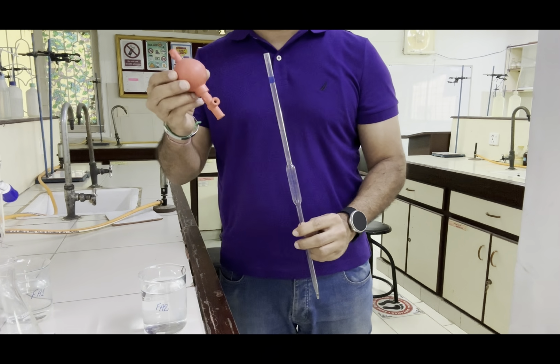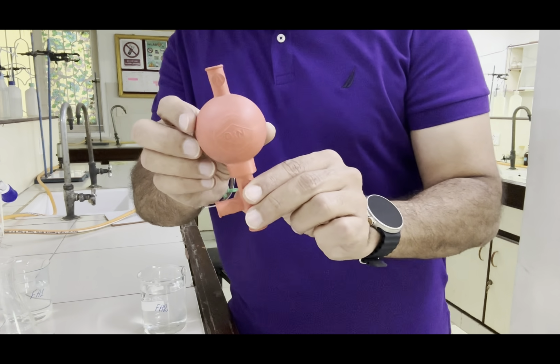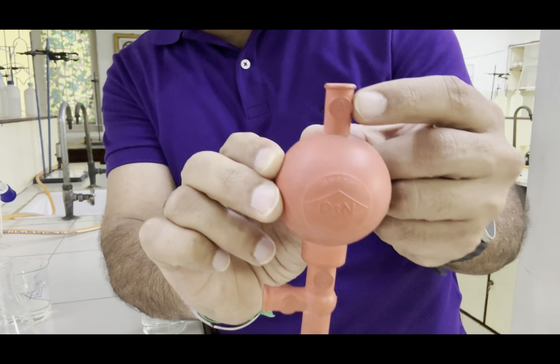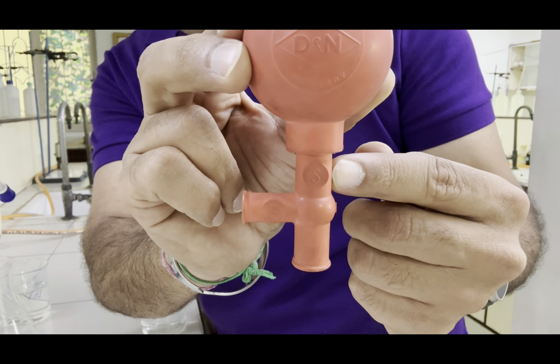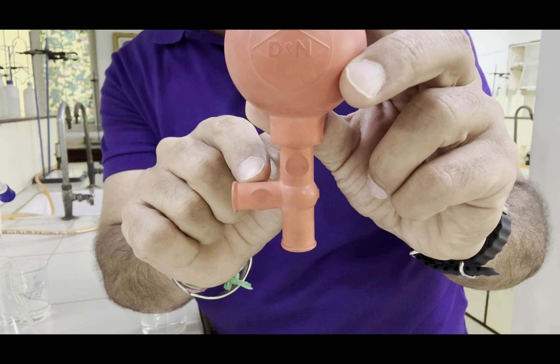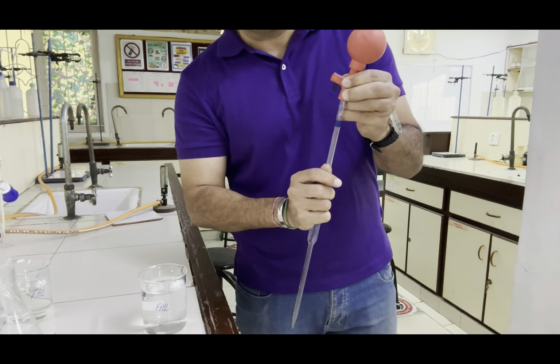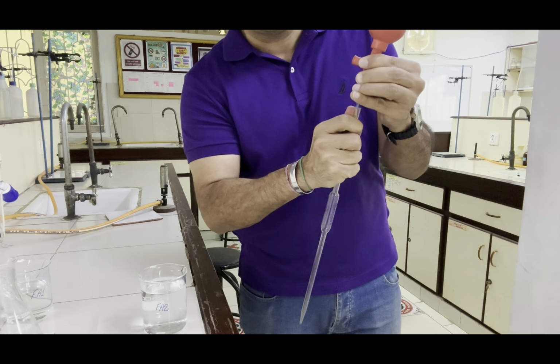We will use a pipette filler. Now, what is a pipette filler? Pipette filler is an apparatus that is used to fill the solution in a pipette. It has 3 buttons. One is here, that is A. Then the button here is S, suction, and there is a button here E, which is eject. So what we need to do here is, first of all, we will attach this pipette filler at the top from this end.